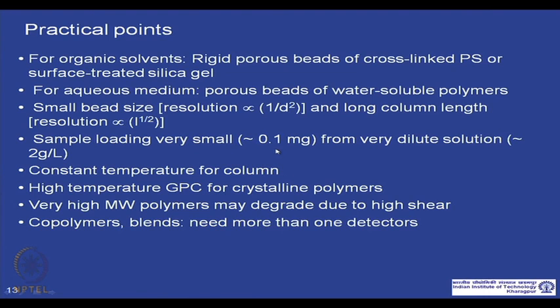Obviously, the sample loading is very small, from a very dilute solution, especially when you are using detectors like light scattering and viscosity. There our assumption is the solution is very dilute, so that we can consider the specific viscosity divided by C as an intrinsic viscosity, and the molecular weight obtained by light scattering. So, there will be less error.